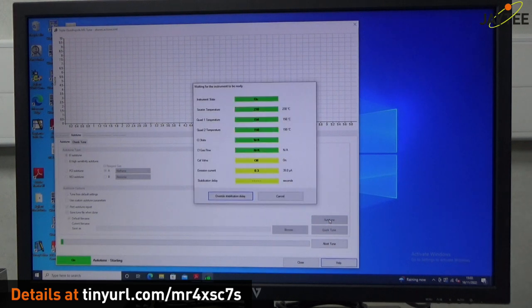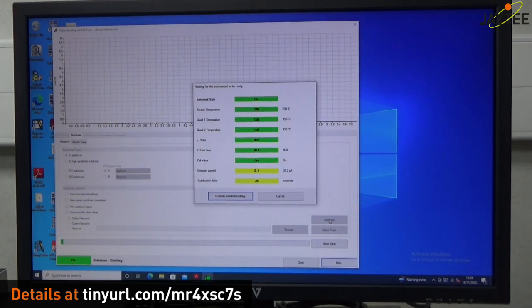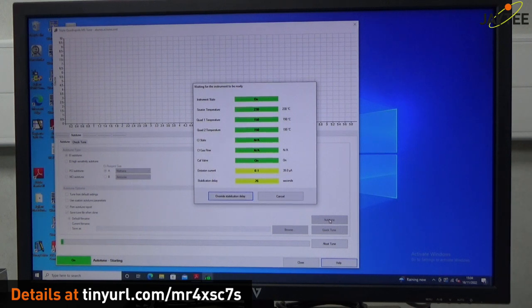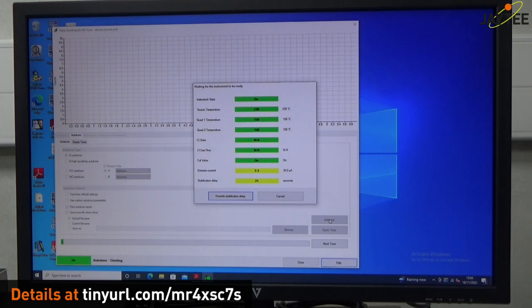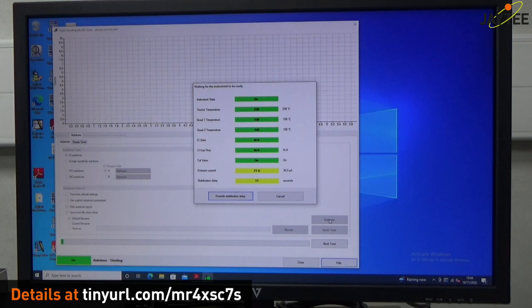And it's just settling down. That stabilization delay, that's just letting the calibrant in, which is perfluorotributylamine. And the emission current is going up to 35 microamps.